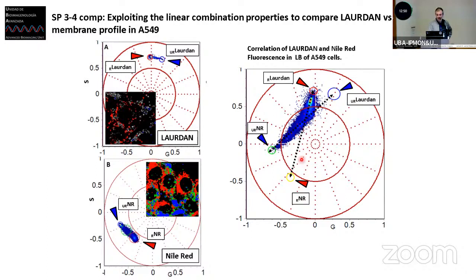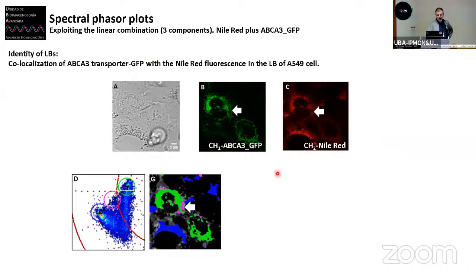So now I use the secondary marker, the Nile Red, in order to prove to which kind of environment the molecular marker was co-labeling and the lamellar body was interacting. Basically, I use all these tools and this example because it was a great example of how much power this linear combination has to explain something that switching a fluorescent protein would take a minute to do, right? But it's a very nice example.